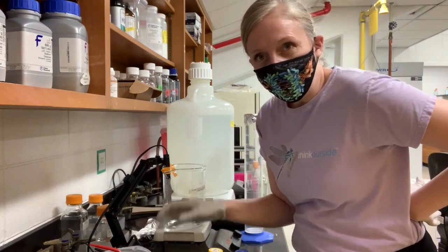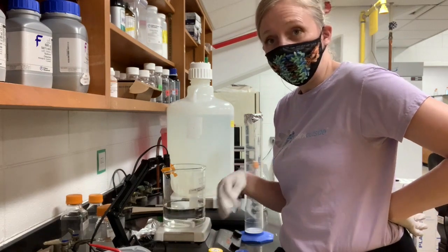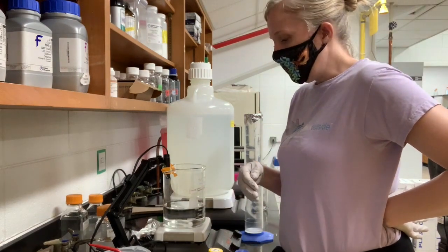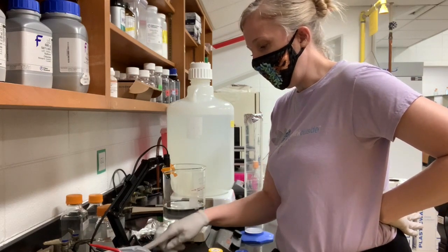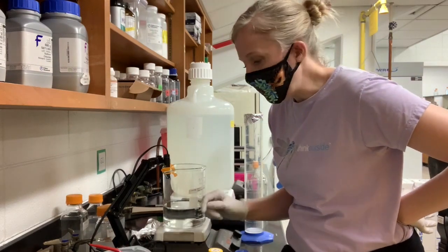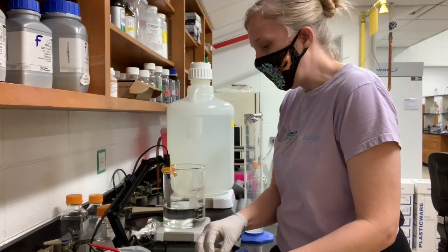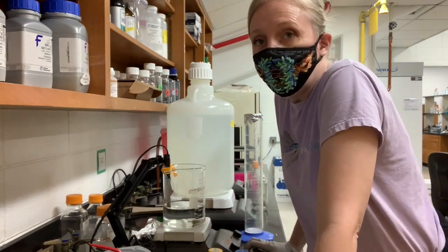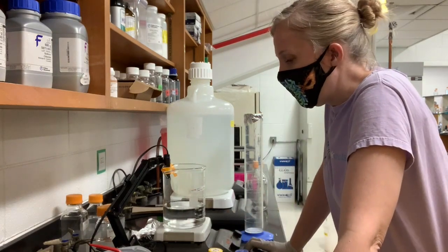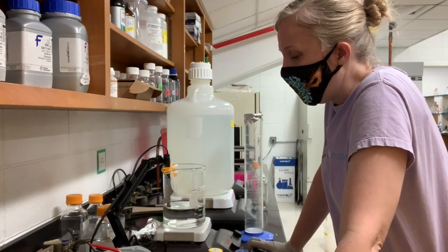There's one kind of weird thing about this meter, which is you have to hit measure for it to measure. Once you hit measure, there will be a blinking word saying stabilizing. And once the meter gets a stable reading, the blinking will stop and it will say ready, and it will give you a number. So this is reading as 6.68 and says ready.